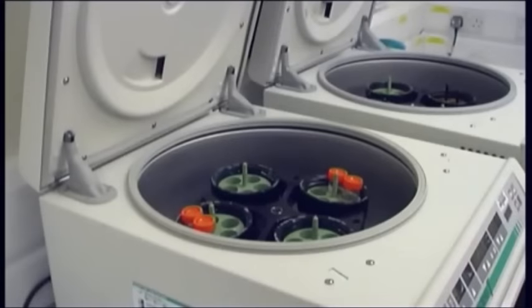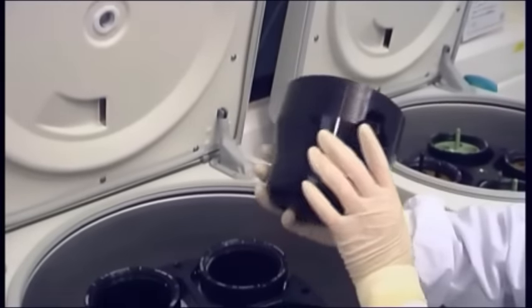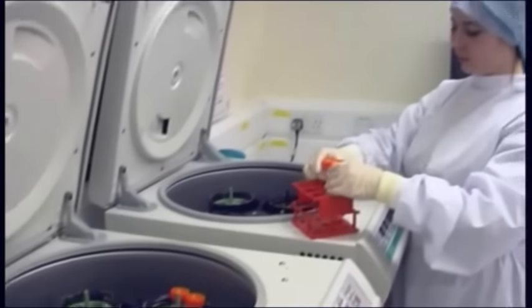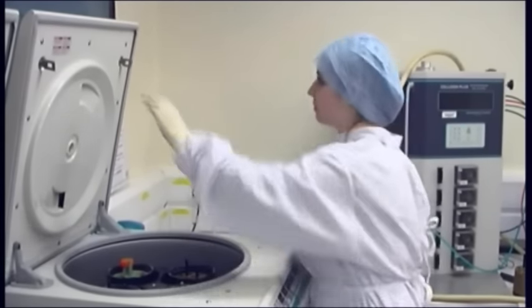Centrifuges are used to rapidly sediment cells into a pellet, to allow transfer of cells into different media or buffers. A small benchtop centrifuge, with controlled braking and rotors, with swing-out buckets and sealed caps, is sufficient for most purposes. Situate the centrifuge where it can be easily accessed for cleaning and maintenance, and away from microscopes, which can be affected by vibration. During centrifugation, care should always be taken not to overfill the tubes, and to balance them carefully to reduce the risk of damage to both the centrifuge and the cells, and reduce aerosol generation.